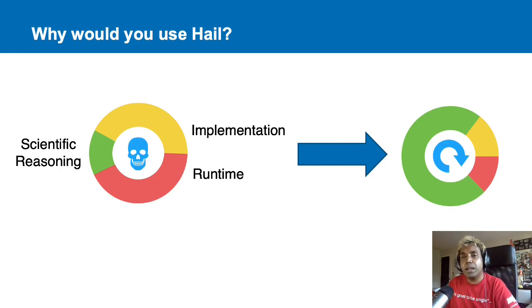Another thing that I think about is also the QC steps, just running the QC after I've already established what QC parameters I want to use to filter down to variants which are of interest, or at least of high quality at that point.